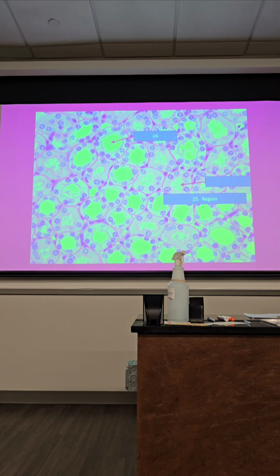Okay? Alright, so it's saying 24, it's 24. DCT. Right, that'll be the representation of a DCT, and this right here is what? PCT. You can tell that. Right, PCT, okay? Alright, next one.